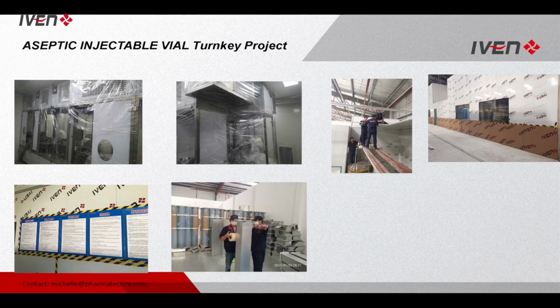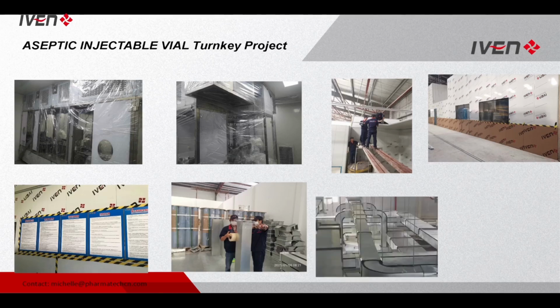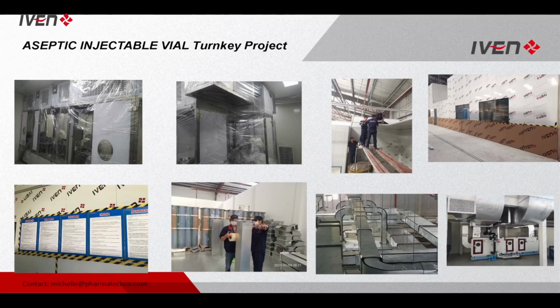Here is our air duct. You can see the environment is very clean and neat. When we do the assembling of the air duct, we also have the ceiling here to avoid dust going inside the air duct, which fully complies with the GMP process. Here is our air duct installation. Here is the AHU system.